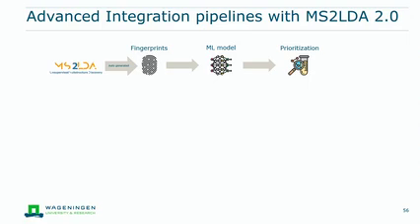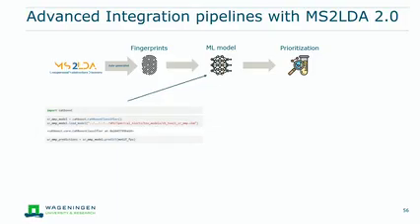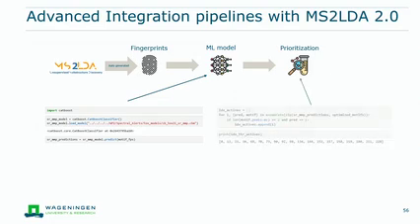And then what I did is I trained a machine learning model. This is not much you need to do. I used a Tox21 dataset, and it's probably like 10 lines of code, maybe even less. Then you need 3 lines of code to load it and predict the fingerprints with this tool. And then, because again, food safety, right, I maybe want to prioritize certain substructures based on their toxicity. So I have all the predictions, and then with another 4 lines of code, I can prioritize my compounds based on whether they are toxic, and I also filtered that I want to have at least 2 fragments. And then I get a list. It's not too long, maybe 20 values.